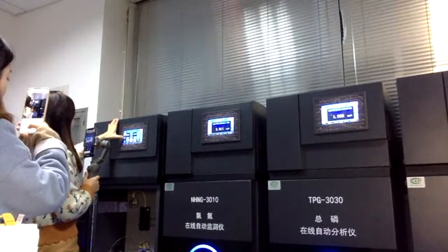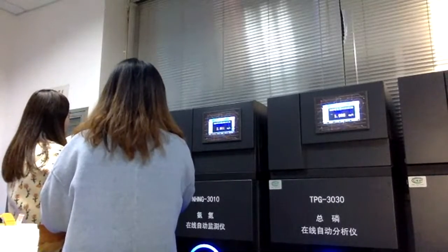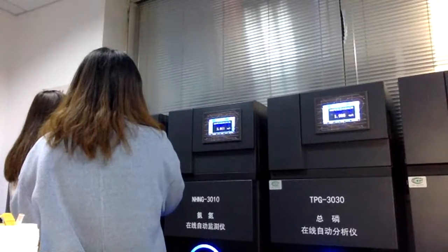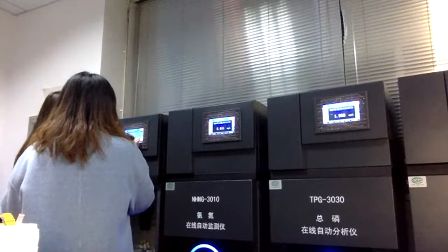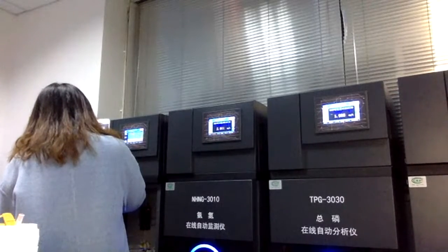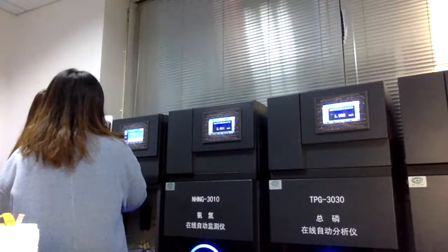Besides this, we have the history data. You can see we have data for different times. So when you want to check what the data showed yesterday, it will be shown here, and you can also see a detailed measure range showing in January. So you can check the whole historic data from this part and ensure whether the system is working properly and whether any data have issues. All of this is checked on this page.